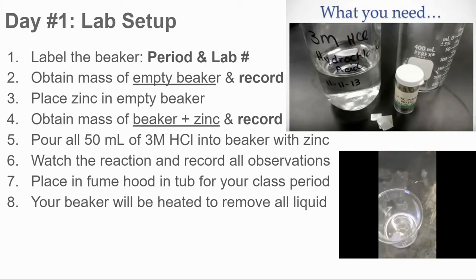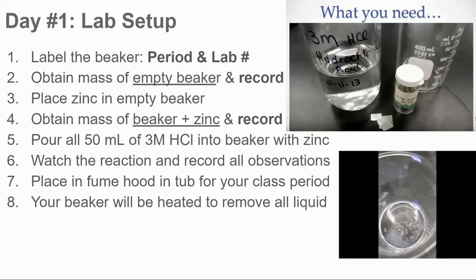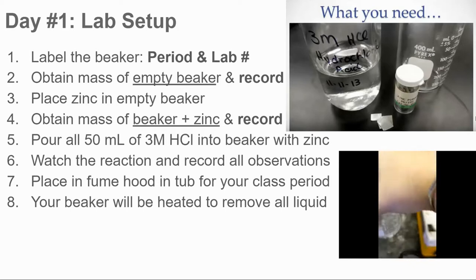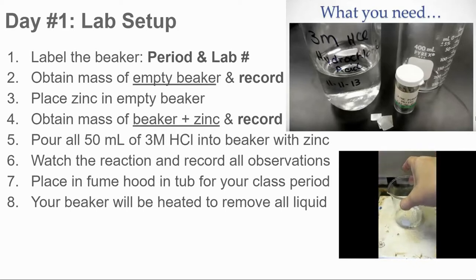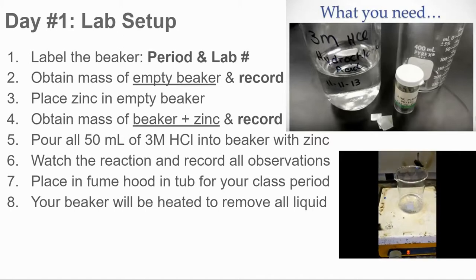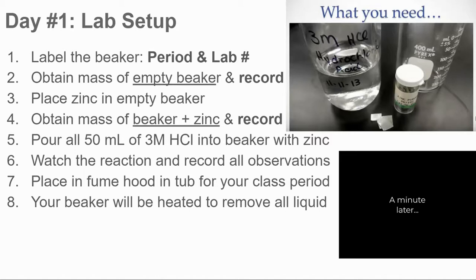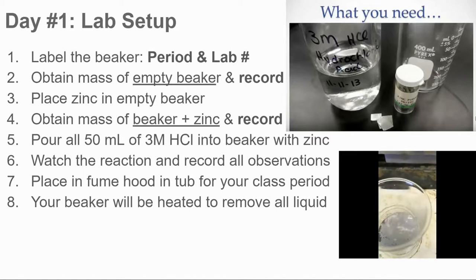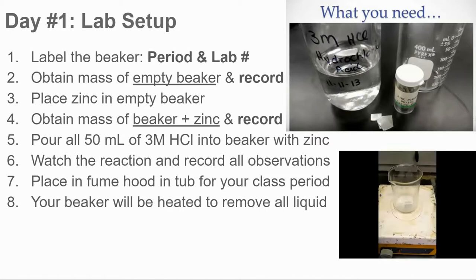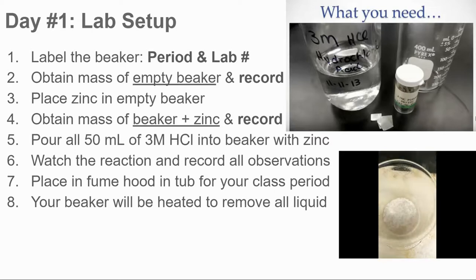And then watch the reaction and record your observations. And you can see here that there's some bubbling and fizzing. And so we know that that must mean that gas is produced. This will be in the fume hood for some time, and then your beaker will be heated in order to remove all of the liquid. And then later, you would see that there's still some liquid. Keep heating. Keep heating. Hey, that looks a lot better.